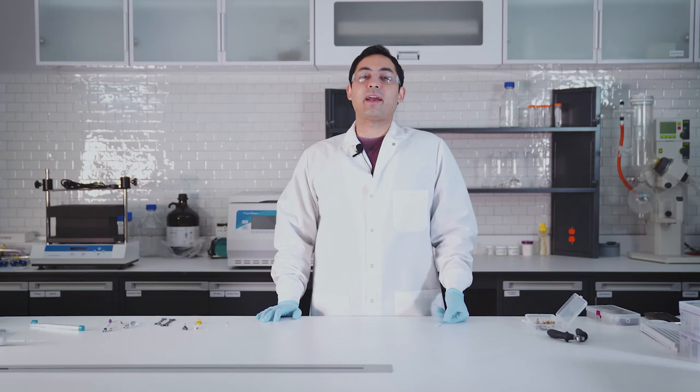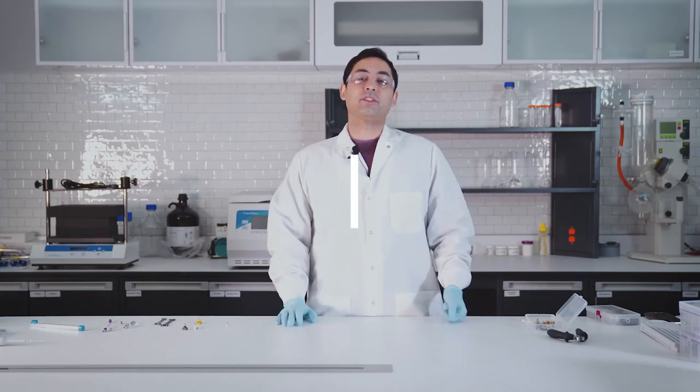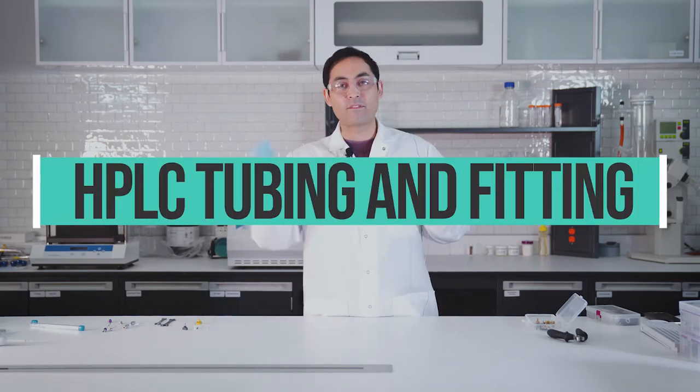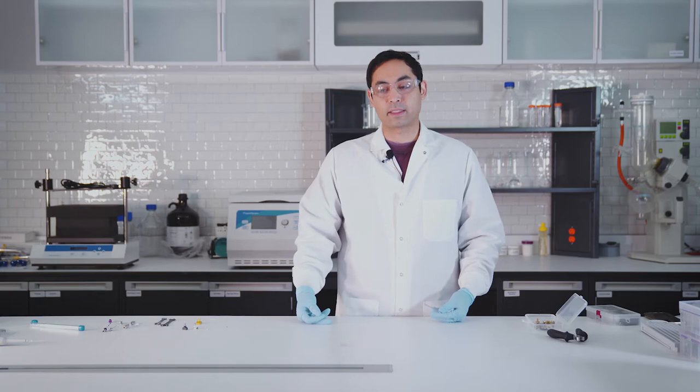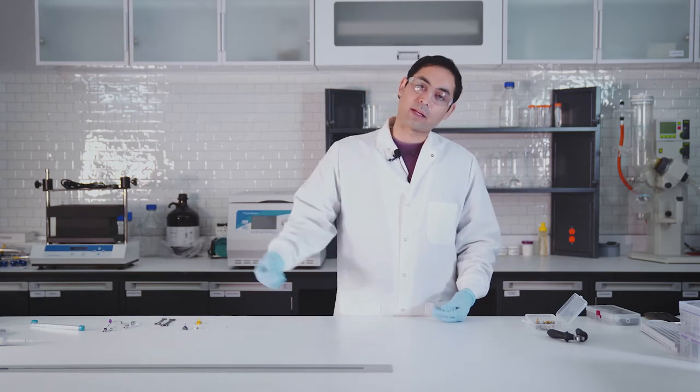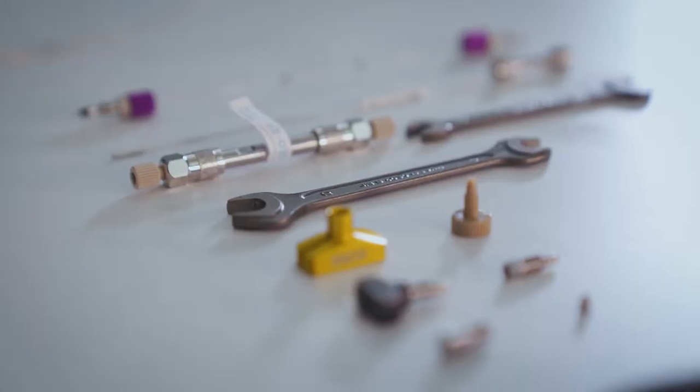Hey everyone, how's it going. Today we're gonna be talking about tubing and fittings, HPLC tubing and fittings to be specific. When you generally buy an HPLC, you get tubing that comes with the instruments. Most instruments, especially standard HPLCs and UH PLCs, sometimes come with different tubings and fittings that we'll talk about in a bit.